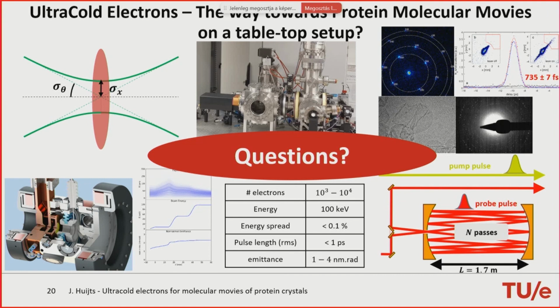And the second question would be, if you try to record molecular movies, the samples are still on a carbon support in vacuum, so non-hydrated. Do you have an idea about hydration of the sample? No, this is indeed very important. In our current setup, because the energy of the electrons is so low, 8 keV, as I said, the sample thickness is limited to 10 nanometers. So you cannot have a hydration layer and some windows in between, that doesn't work.